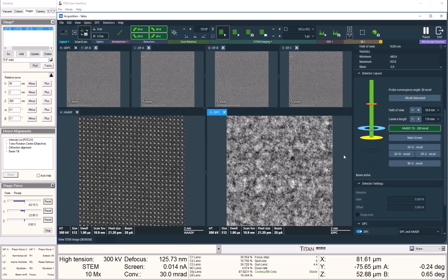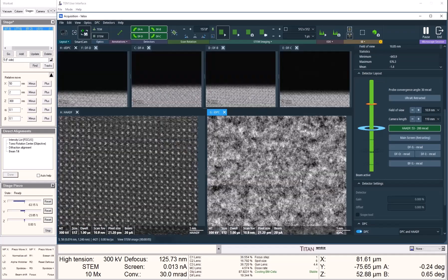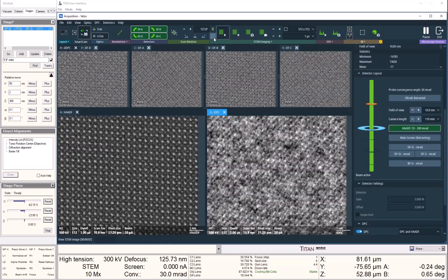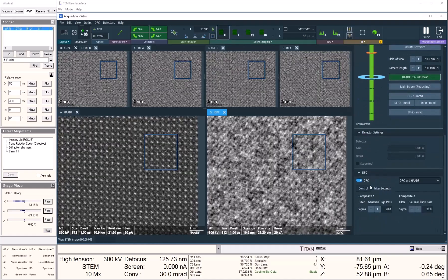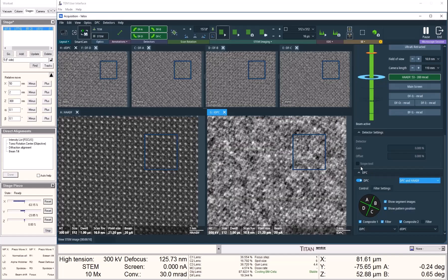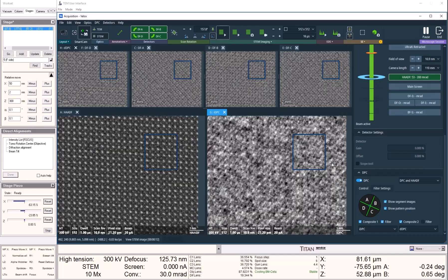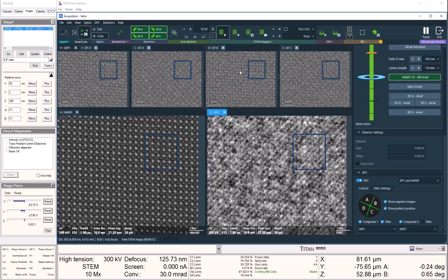Once we lift the fluorescent screen, we can see live images from the dark field detector and the live IDPC image. I am going to focus the image using a small window and just make the image look as sharp as possible.